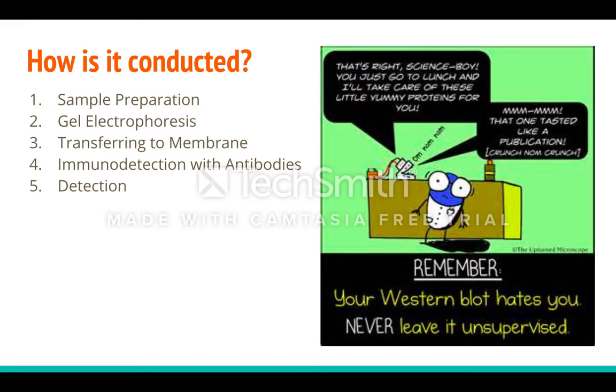So SDS stands for sodium dodecyl sulfate, which is a solution that denatures proteins and eliminates factors that may influence how they travel, except for size. The samples are then run using PAGE, which stands for polyacrylamide gel electrophoresis, which is the physical running of the gel itself. The second basic step is immunoblotting, which involves using a pair of antibodies to bind to and detect a protein of interest. A Western blot is an extension of SDS page because you use the SDS page and then transfer it to a membrane with an antibody.